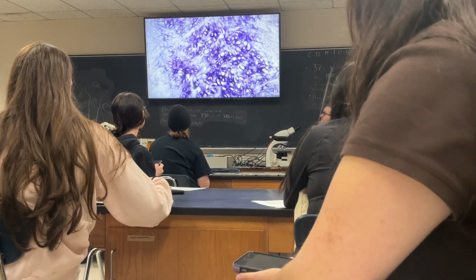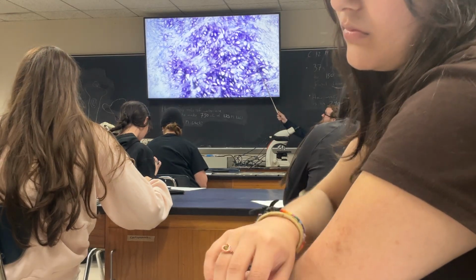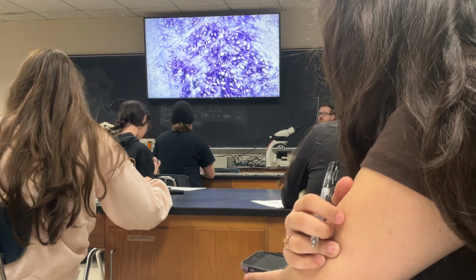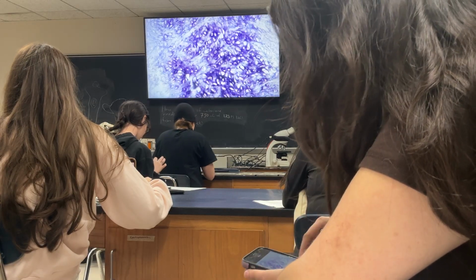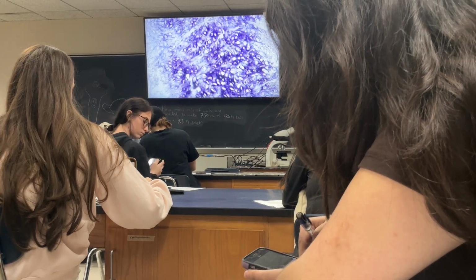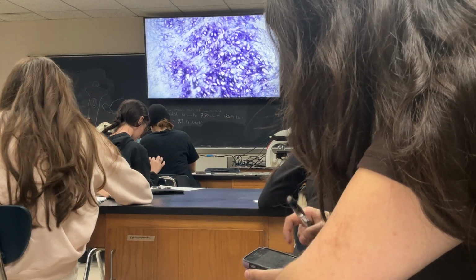So I see lacunae. Each of these white spaces are empty, and there's a cell that's still left behind, but in each of these spaces would be a cell. Those spaces are lacuna. Does anyone remember what tissues have lacuna? So cartilage and bone have lacuna. These lacunae are nice and round and open, which tells me it's probably cartilage. Also bone looks the way that bone looks, so this doesn't look like bone. We'll see that in a second.